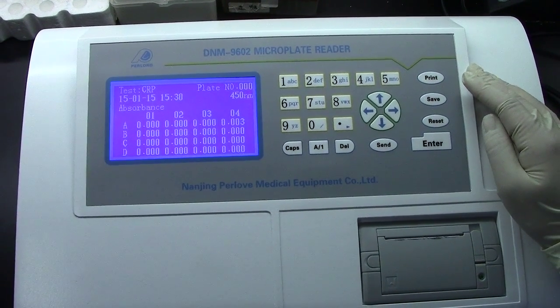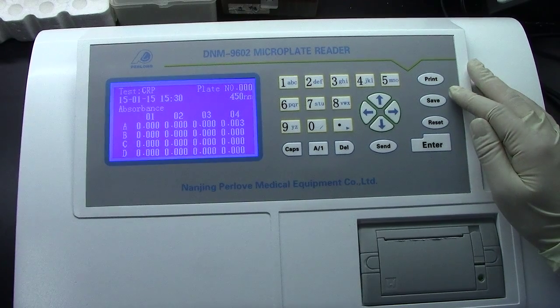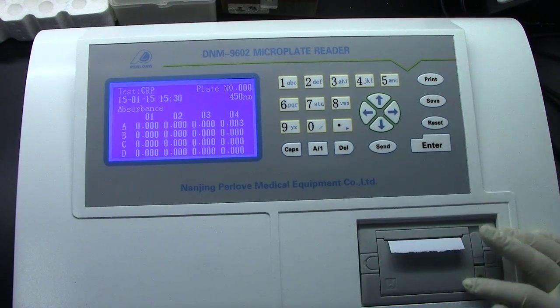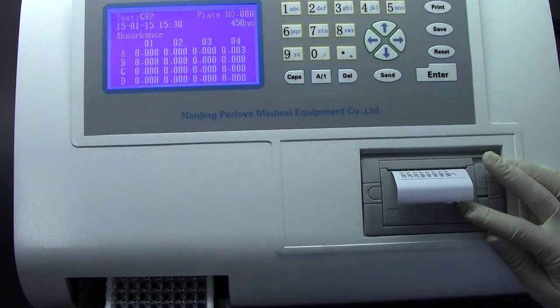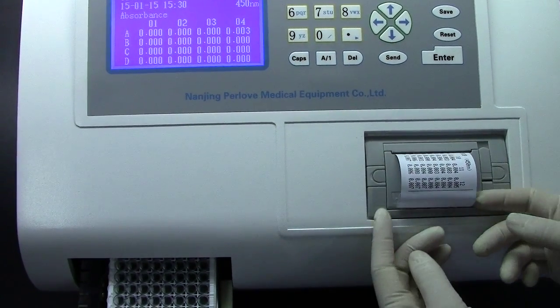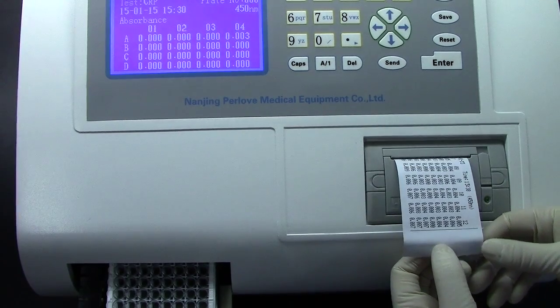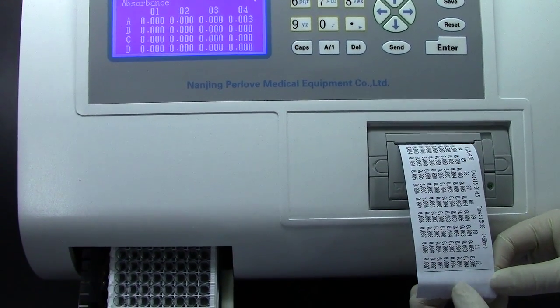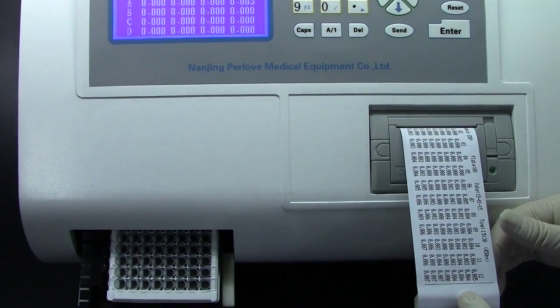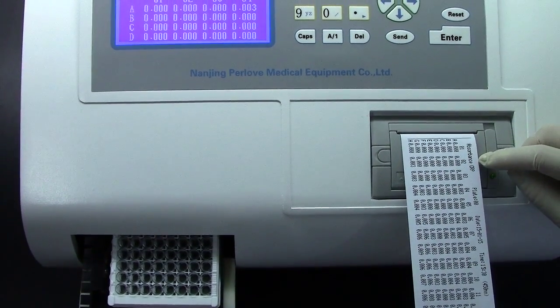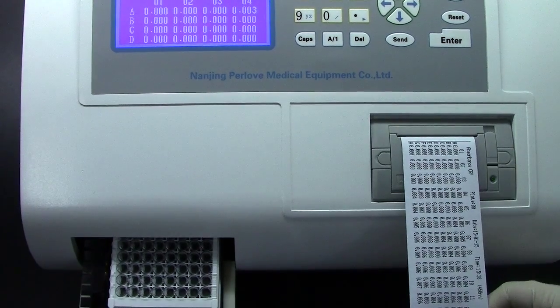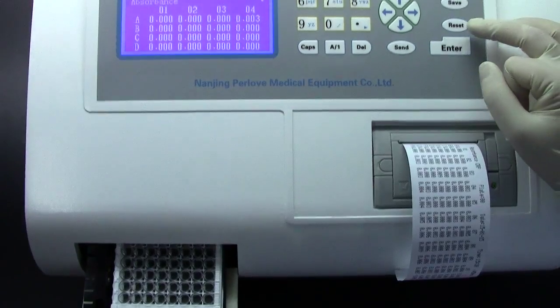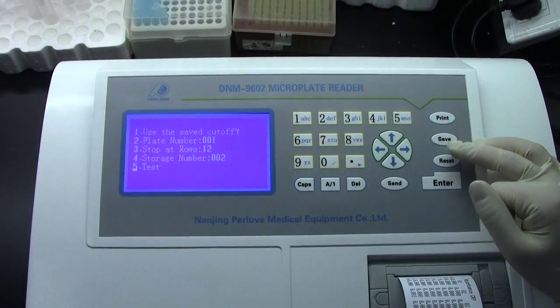If we want to print the result, press the print button. It will automatically print the result. CRP is here. Now we reset to the main menu.